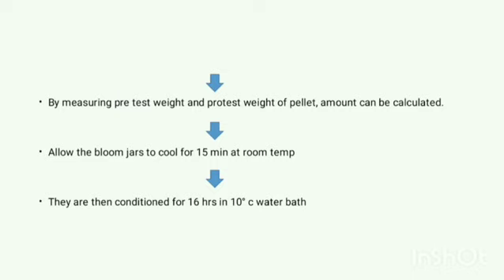Allow the bloom jars to cool for 15 minutes at room temperature. They are then conditioned for 16 hours in a 10 degrees Celsius water bath.